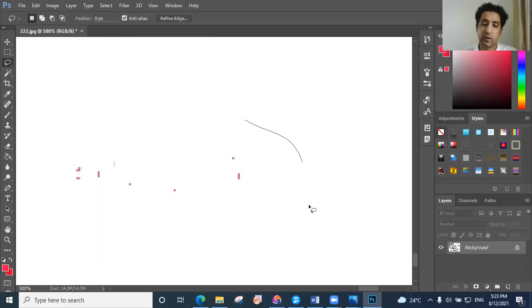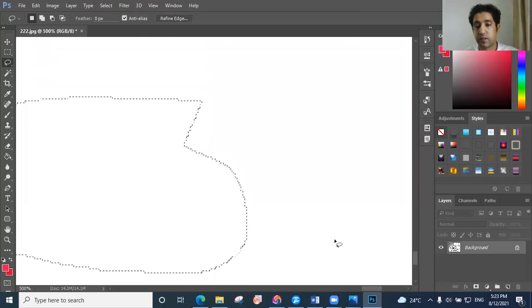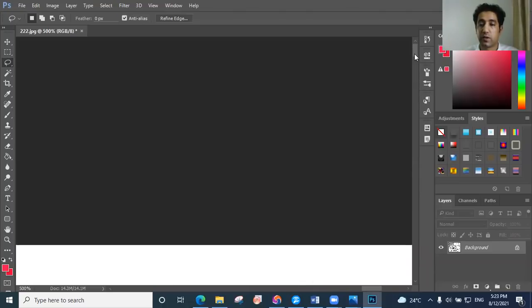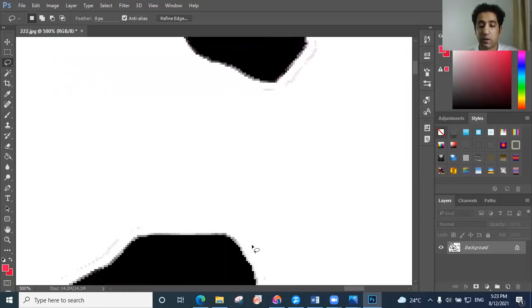All right, here also make line like this and clean. Well, you almost finish this side. So after you finish this side, you can go to another side one by one here. All right, go.